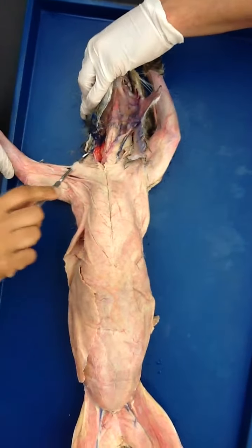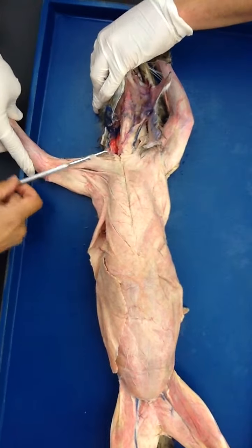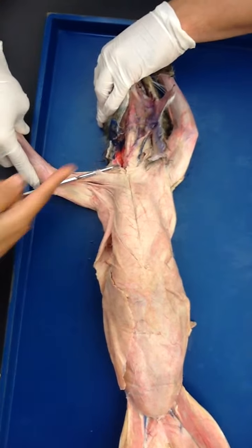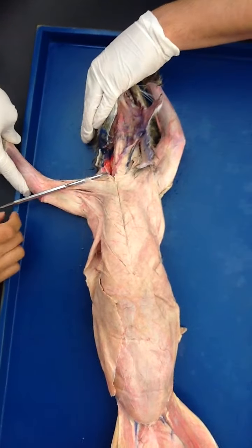Are we just cutting with the probe? No, we're using the scalpel — you should be doing it. You put your probe under there and cut with the scalpel on top of the probe, so you're not cutting the underlying structures.